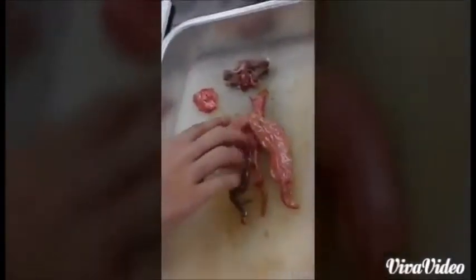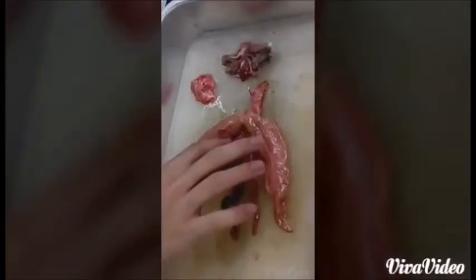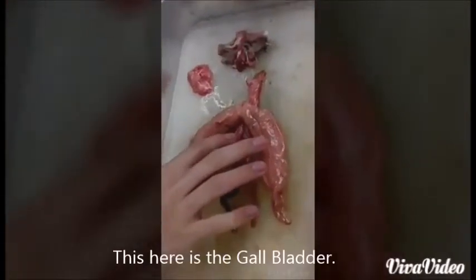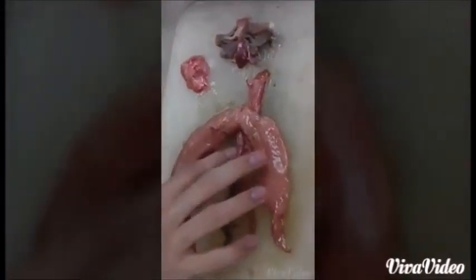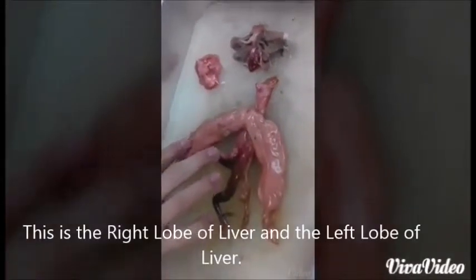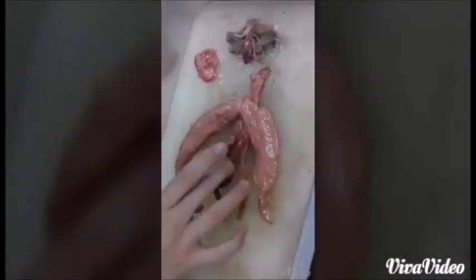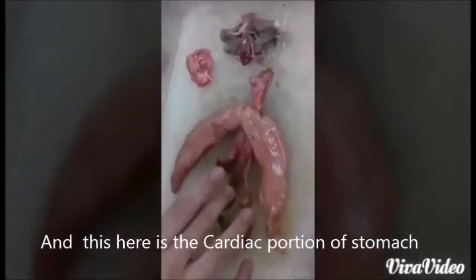As you can see, this is the median lobe of the liver. This here is the gallbladder. This is the right lobe of the liver, the left lobe of the liver. And this here is the cardiac portion of the stomach, the oesophageal papillae.